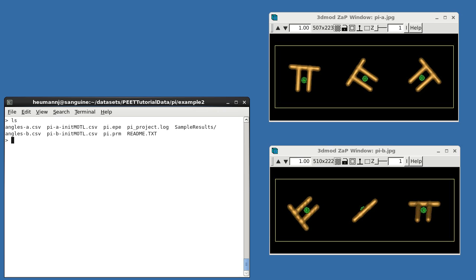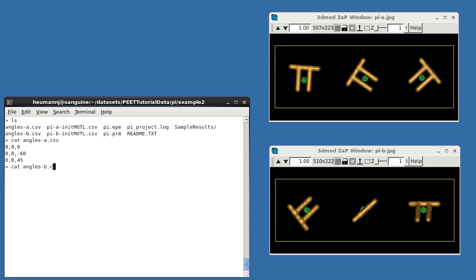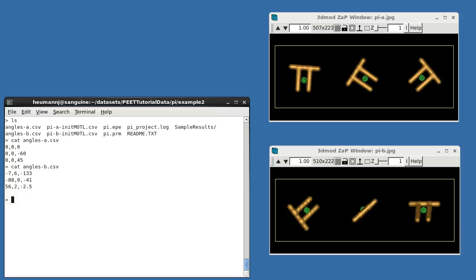In the example 2 project directory, I've placed these angles in a file named anglesa.csv, with the fields in each row representing so-called slicer angles, namely, rotations in degrees about the x, y, and z tomogram axes respectively to be performed in reverse order. The slicer angles required for particles in the second volume are less obvious. For demonstration purposes, we can estimate them by rotating the particles manually in 3Dmod's slicer or isosurface view to match the desired reference orientation, and then simply reading off the desired angles. I've done that with the results that you can see in Angles B.